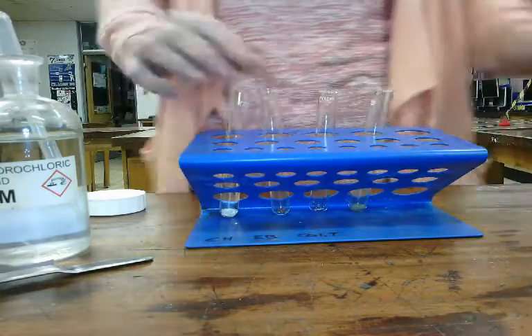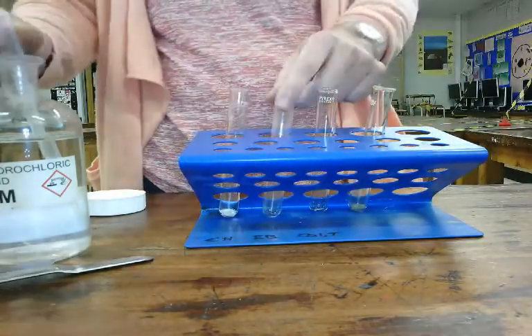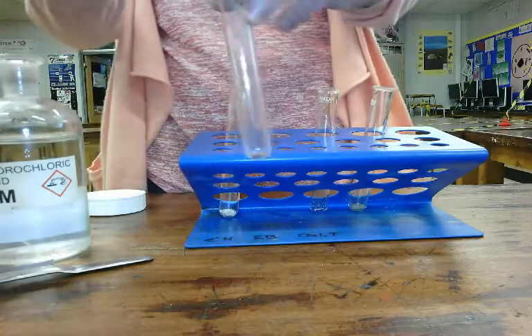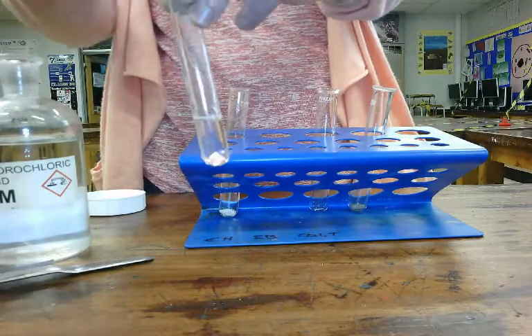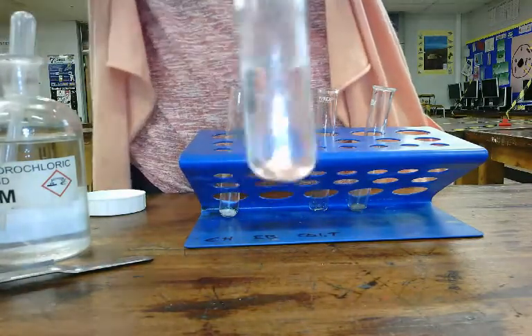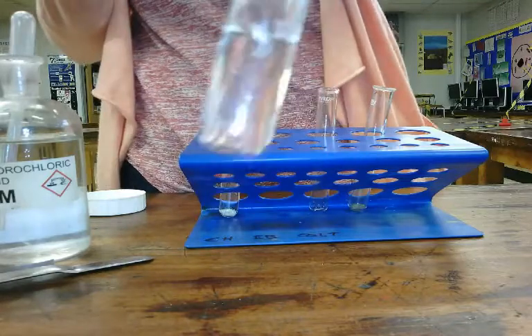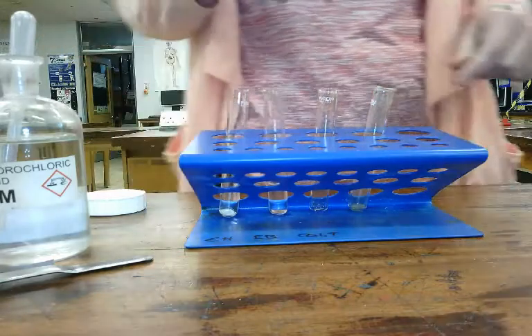The next one we're going to look at is copper, and I'm going to put acid again into the tube of copper. Look at the reaction. No reaction with copper in dilute acid, so no fizzing.